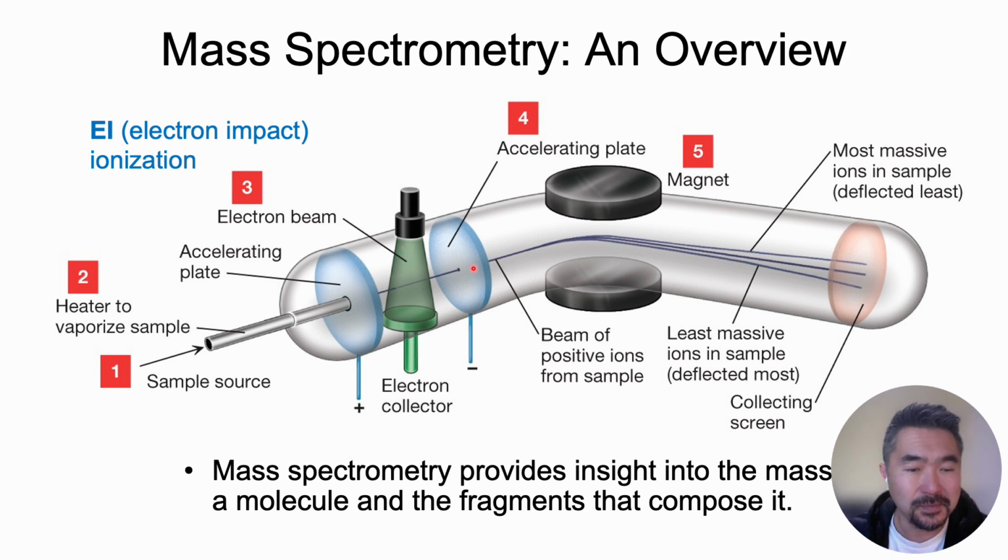And then this charged molecule goes through the detector, and because it's charged, when a charged thing moves through a space, that creates a magnetic field. You might have learned about that in your physics class, perhaps. And because of that, there are these magnets. The reason there are magnets is that the bigger the molecule is, the less it cares about some external force trying to change its trajectory. Big molecules are heavy with a huge momentum, right?